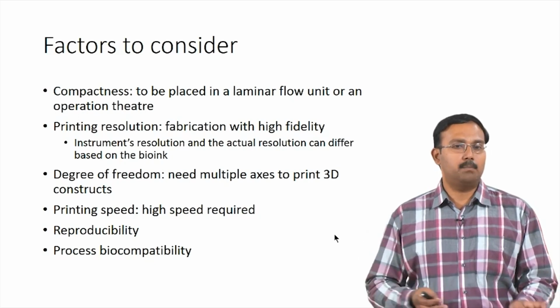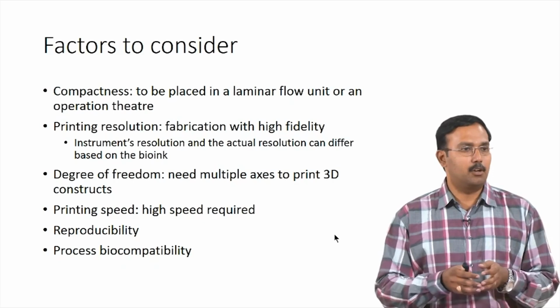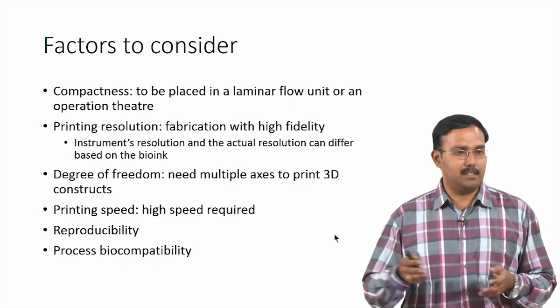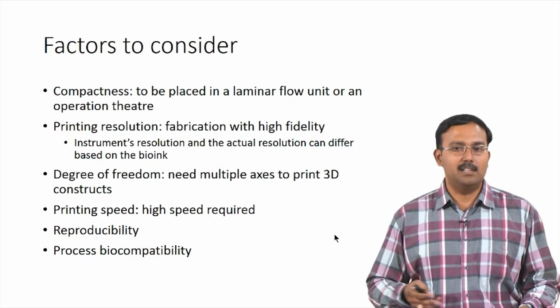Biocompatibility of the ink is one thing, but the process itself can actually kill the cells, right. So, for example, shear or temperature. In inkjet, if you are going to use a thermal kind of DOD, then there can be high temperatures used which could kill the cells.